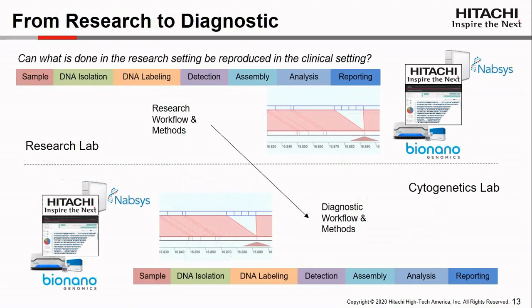There are two commercially available genome mapping platforms: the Bionano Genomics Sapphire platform, which employs optical mapping, and the Nabsys HD mapping platform, which uses electronic mapping. Single molecule map reads from either platform are uploaded to Hitachi's Hce, where they are assembled, aligned to a reference, and visualized as whole human genome analysis for structural variation. And while genome mapping lacks single base pair resolution, it routinely generates long reads, 50 kb to 300 kb and longer, that are necessary to resolve the most complex SV.